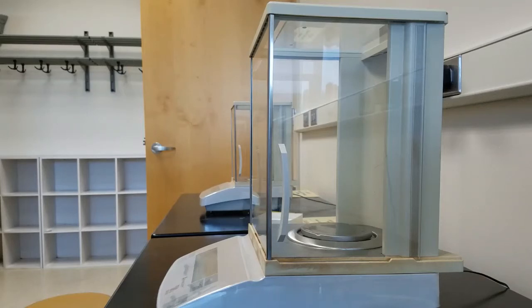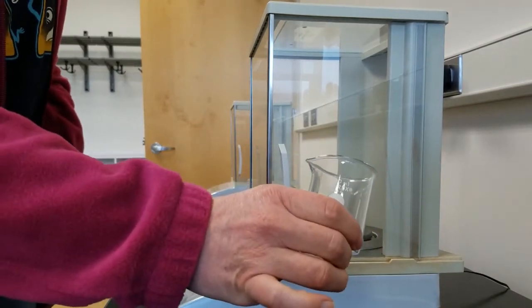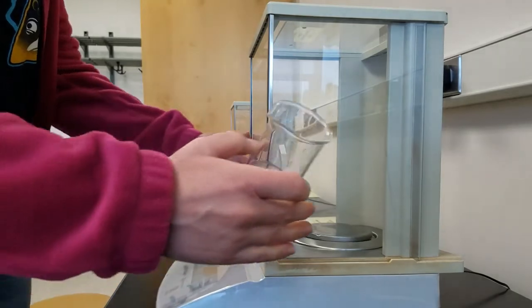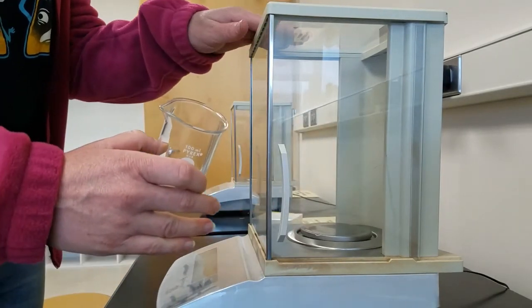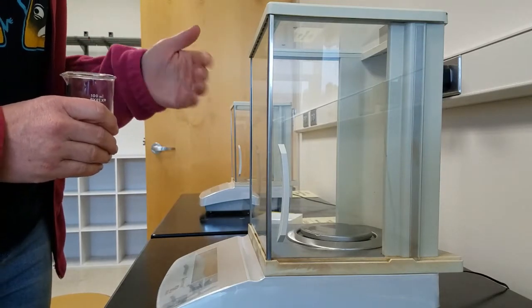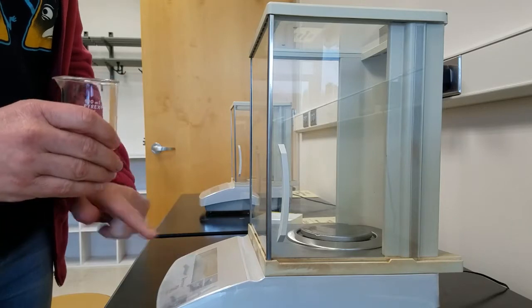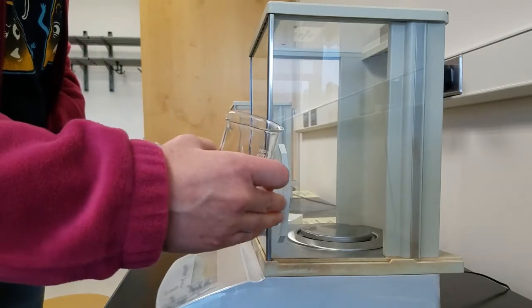For section 3, we are going to use the analytical balance in order to obtain a mass with the most significant figures. So we are going to weigh an empty 100 milliliter beaker. We want to make sure all of the doors are closed on our analytical balance because even air currents can adjust our mass. Make sure that our reading says that it's 0 grams.